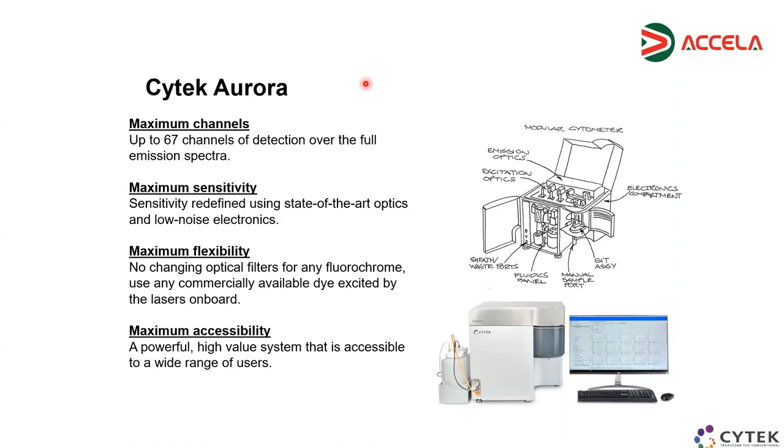You are not the first user asking me whether the Aurora can be upgraded to a sorter. Maybe practically it would be possible, but I think it would be very costly and complicated, so I recommend the user to have directly the system ready as a sorter. I need to check with the technician. It's more of a service question. I don't have the exact answer, but it's more no than yes, practically.